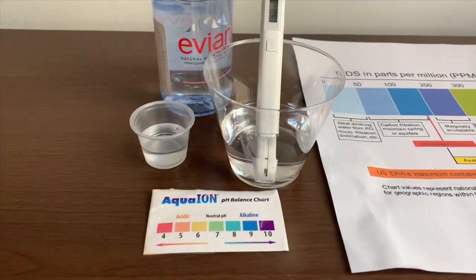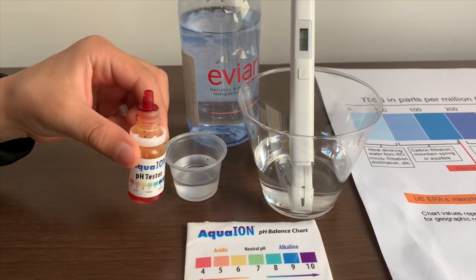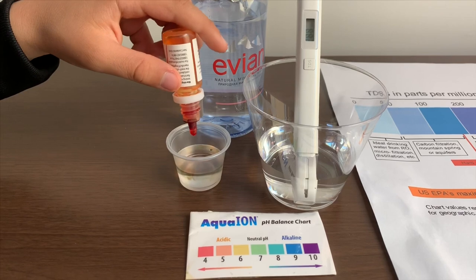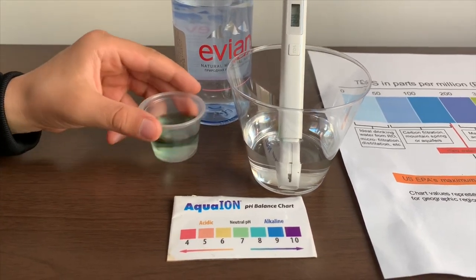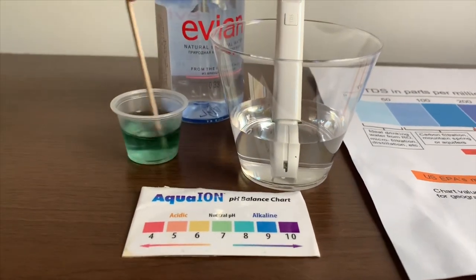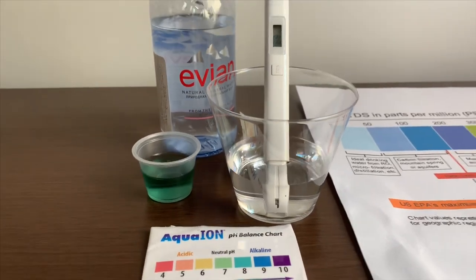Now let's test the pH level. If you want to buy this pH tester, check the link down below. Only do two drops. Let's stir it a little for a better result. I give this an 8. This is alkaline water.